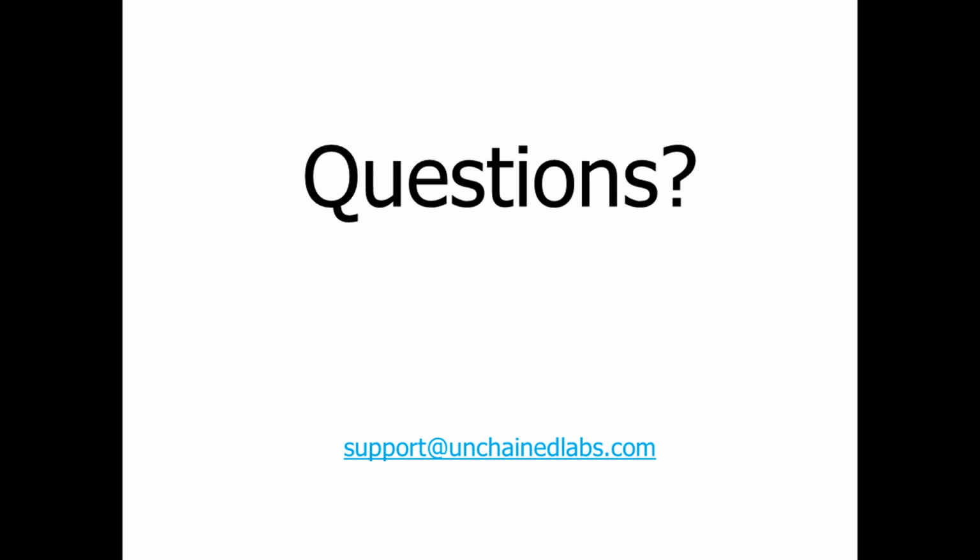Thank you. And our next question that's come in through the chat here: if my system changes, such as adding a new device, will I see those options in Design Creator? Short answer is yes. So if you have different configurations for your system as they already exist, that means that there's tasks and operations that are already tied into your protocol as part of running that system. So you will be able to see those options available to you when you go and use Design Creator with that.